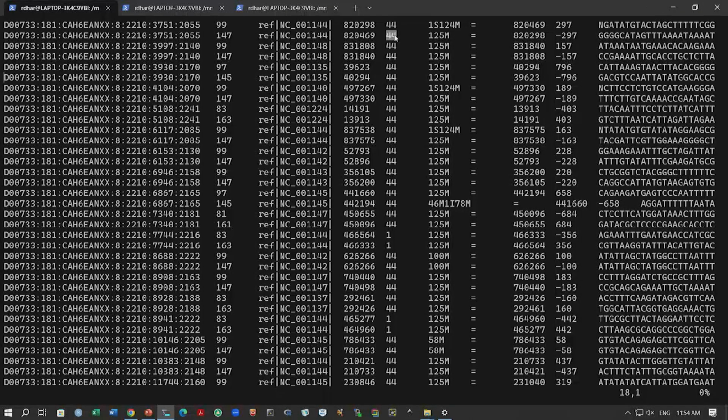The next one is the MAPQ, the mapping quality score, which is 44 here. So, this is quite reliable. As you have seen, we can calculate the probability of error in mapping by calculating minus 10 log 10 E. Higher value is better, so this is good. But for some alignments you see this value is 1.